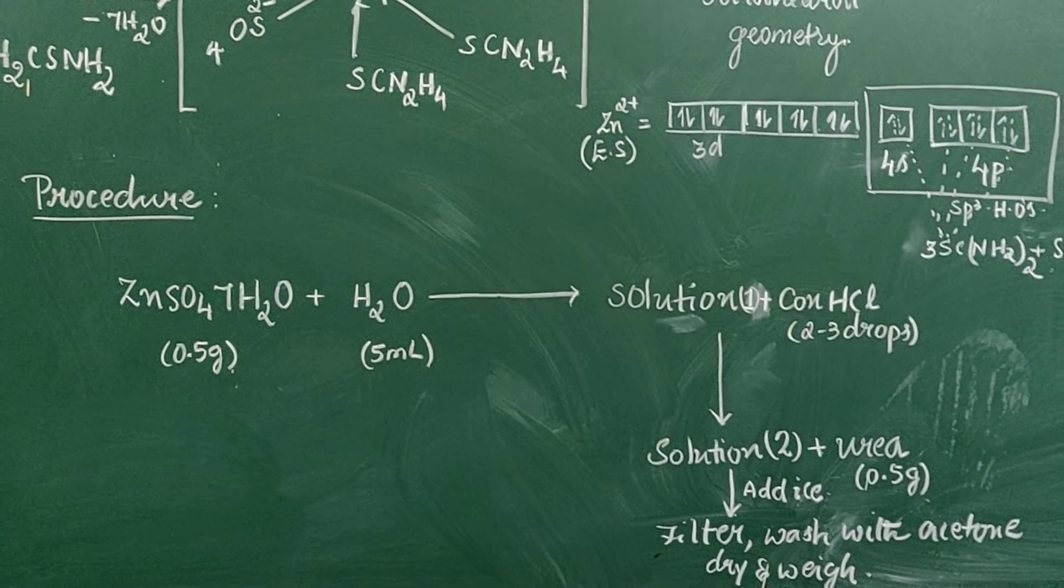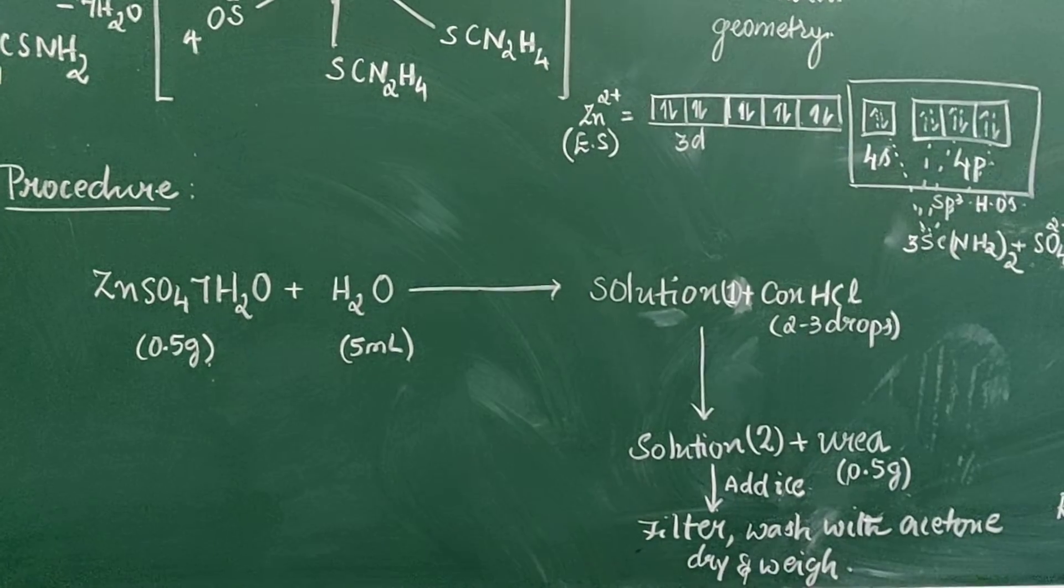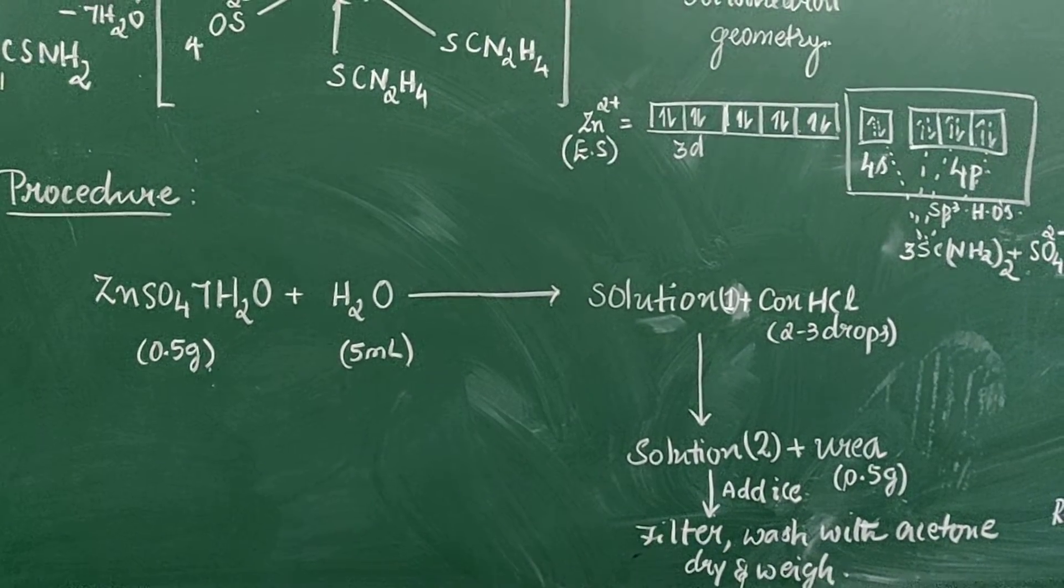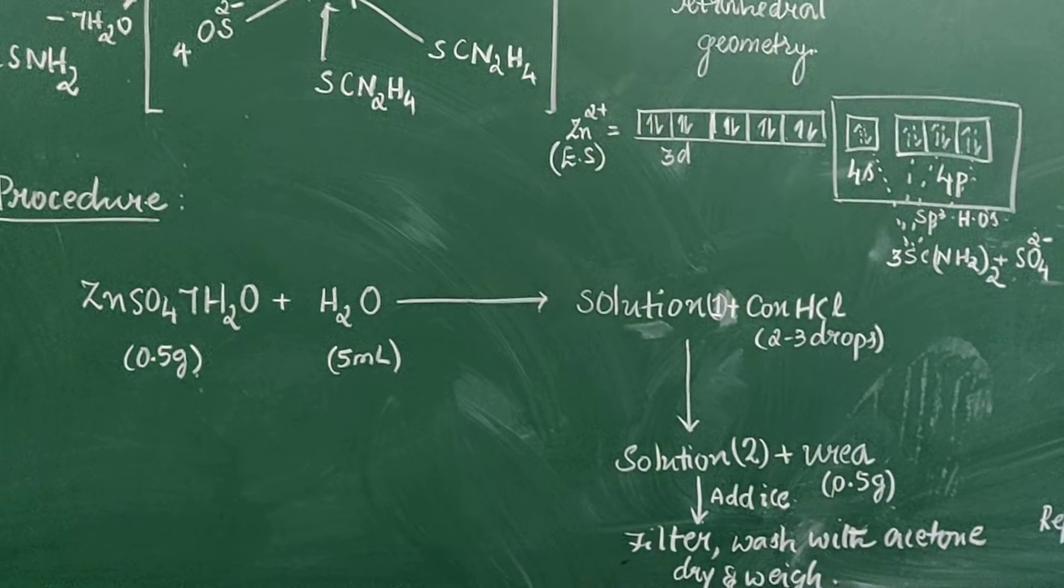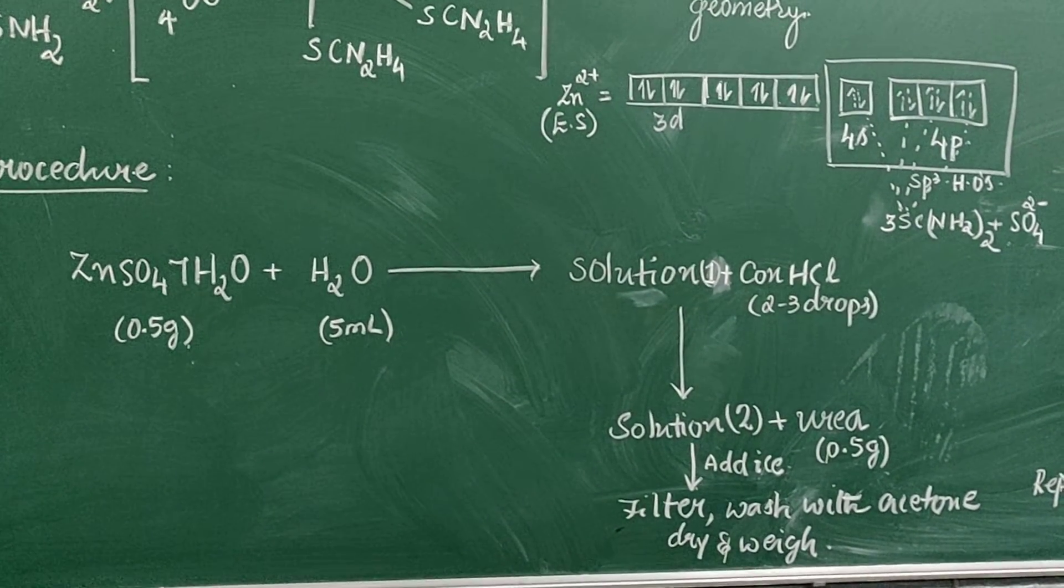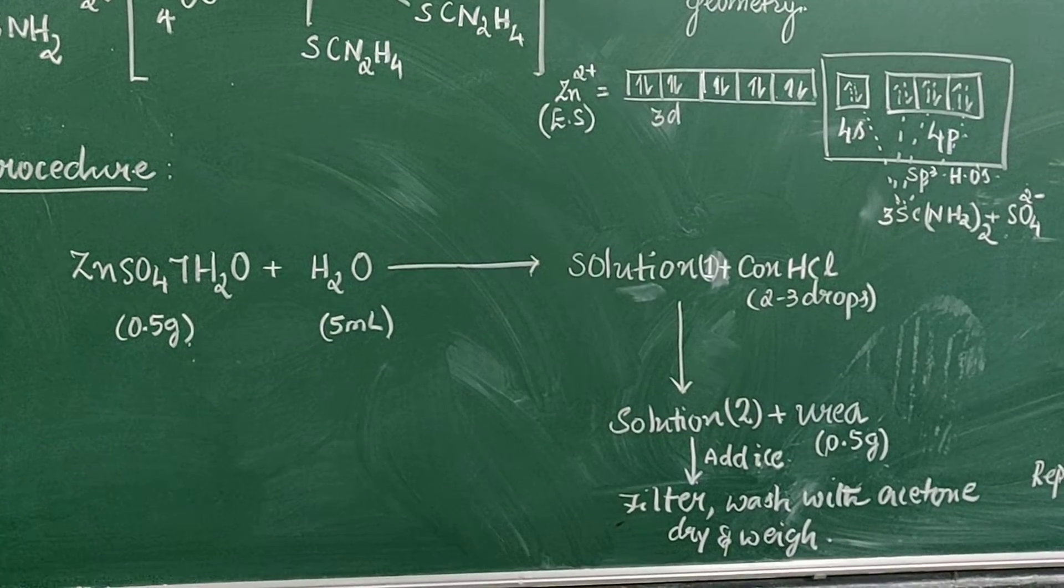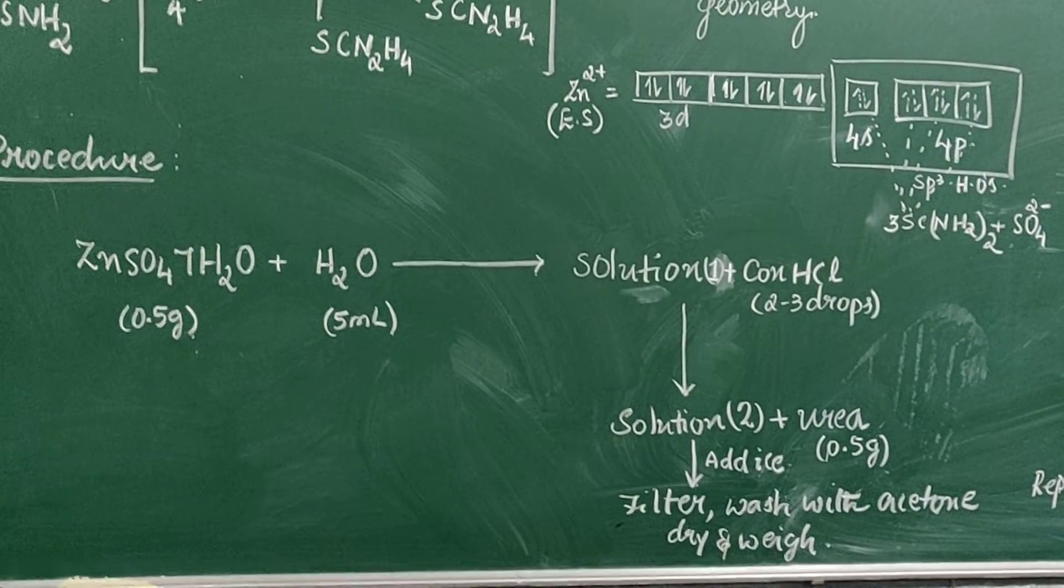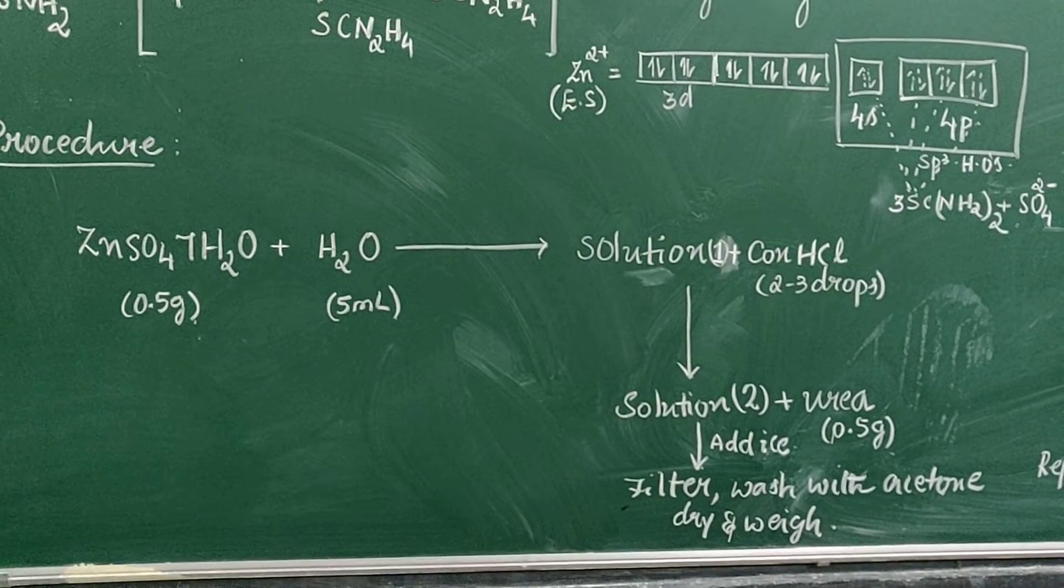To this solution add 2 to 3 drops of concentrated hydrochloric acid. You get another solution, solution 2. To that you add thiourea, 0.5 grams, and then if you do not see the crystals, you can add ice.